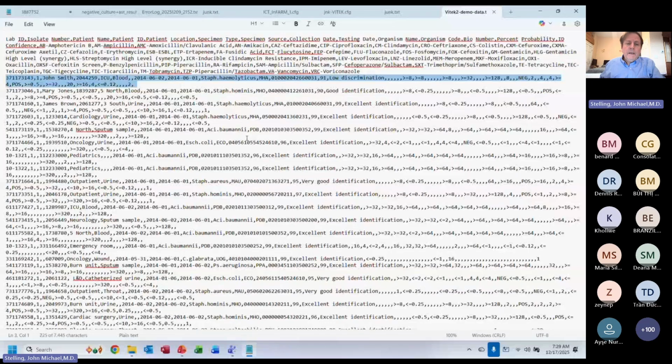And then here you see record number 1, record number 2, record number 3. For example, I can see here, they don't call it Staphylococcus hominis, they call it Staph hominis. Mary Jones is the patient. The location is 5 North. This is a blood sample. You see here the MIC values. It's a little bit hard to read here in Notepad, but it is a text file.